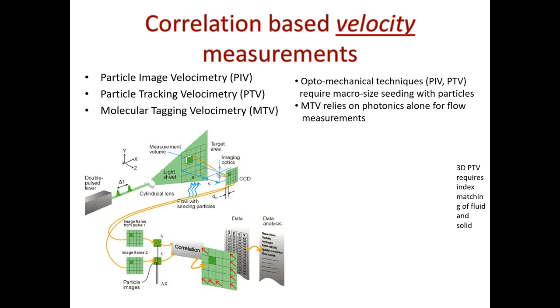Basically, you can image that flow and compare the particle positions in time, and you essentially get velocity vectors for a micromodel or your core. So in two dimensions, that can be done with micromodels. This is a planar geometry, and there's an assumption that you're looking at a projection, and that things flow in the same direction that you have.